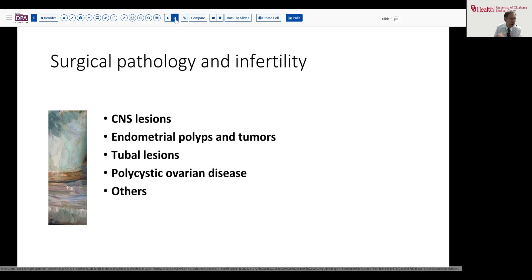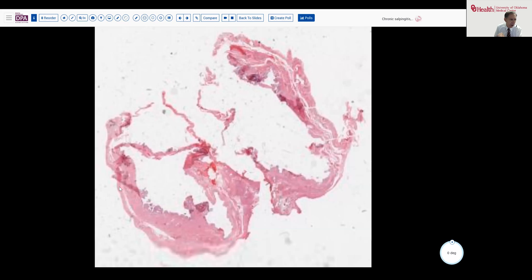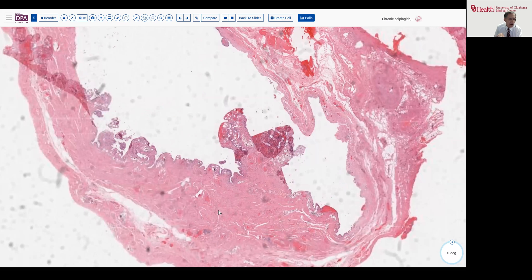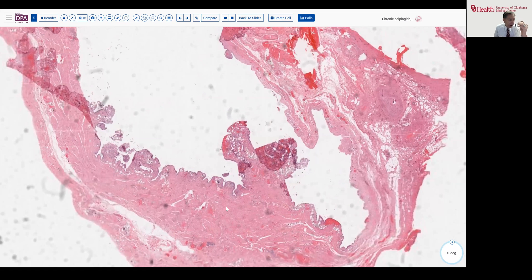In our case, this was a tubal issue. Here are representative sections from a portion of the fallopian tube which was dilated and removed. Rather than just scanning at low magnification and brushing this off as another case of hydrosalpinx, we noticed that there's just a little bit of busyness to this mucosa.